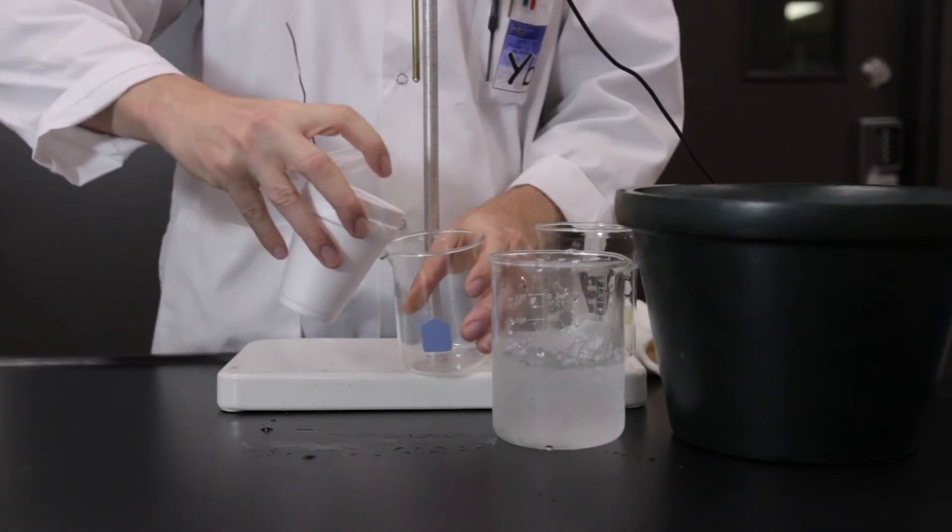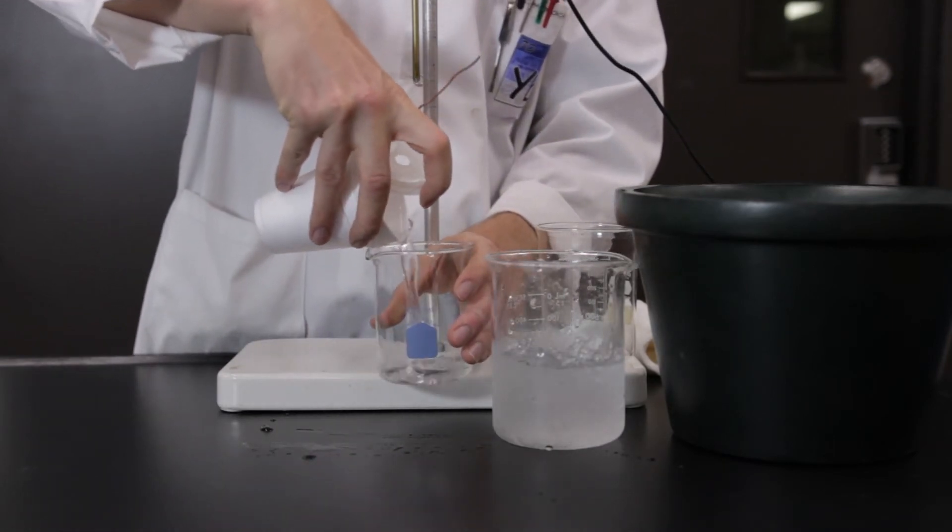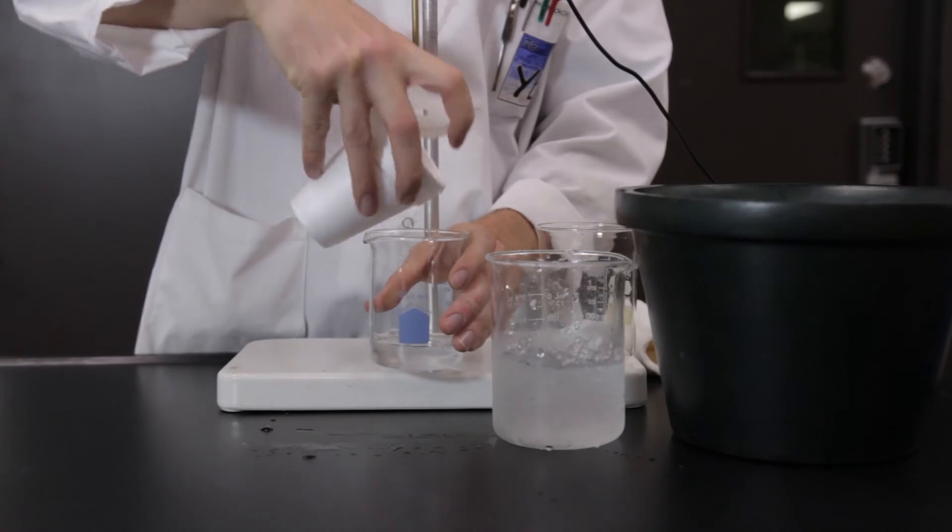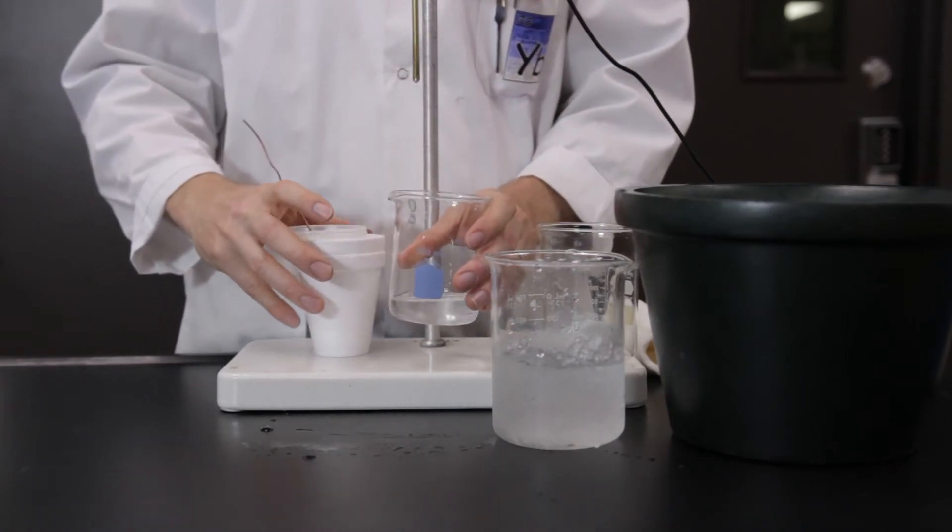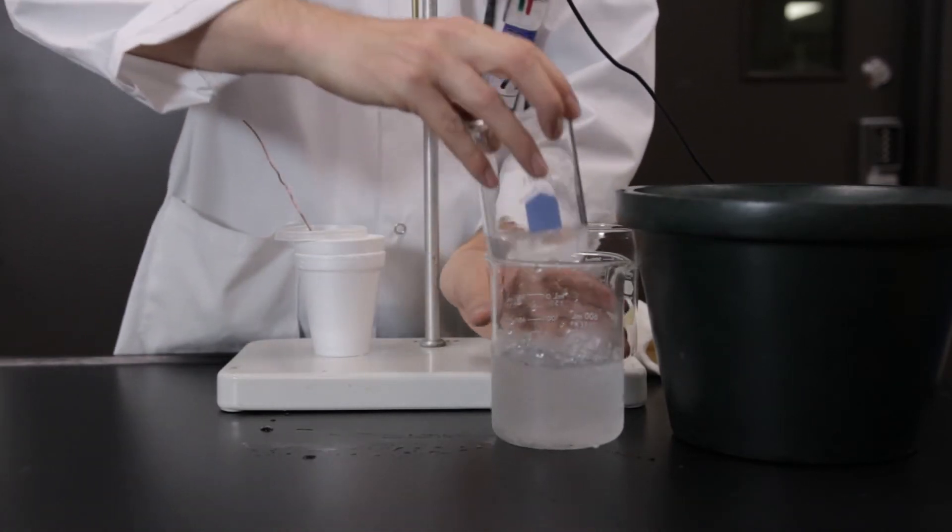Transfer the contents of the calorimeter to a clean, dry, 250 milliliter beaker and immerse the beaker in an ice bath to cool the solution back to the original water temperature.